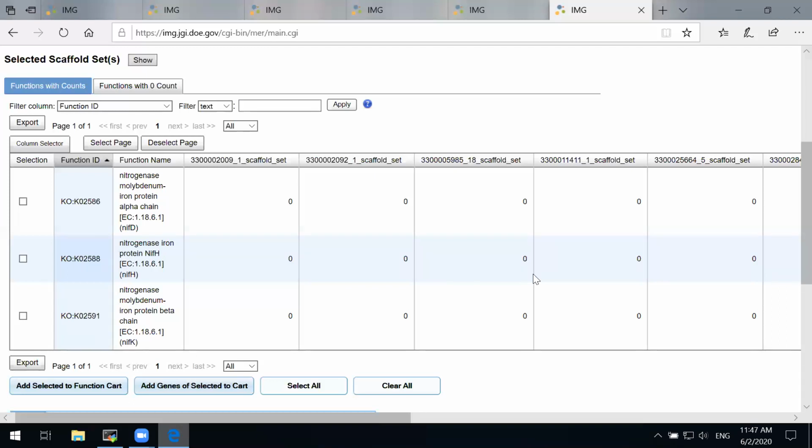So we want to figure out whether it is true that the metagenome bins that we have are an honest representation of the environmental Bradyrhizobium strains, or whether they lack these nitrogen fixation and nodulation genes because of the failure of this binning process, which does not assign contigs that originate from plasmids to the metagenome bin, which mostly represents the chromosome of the strain.